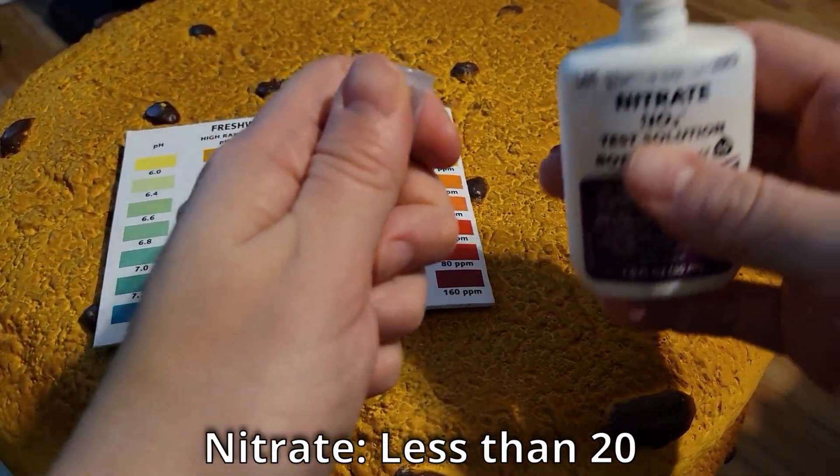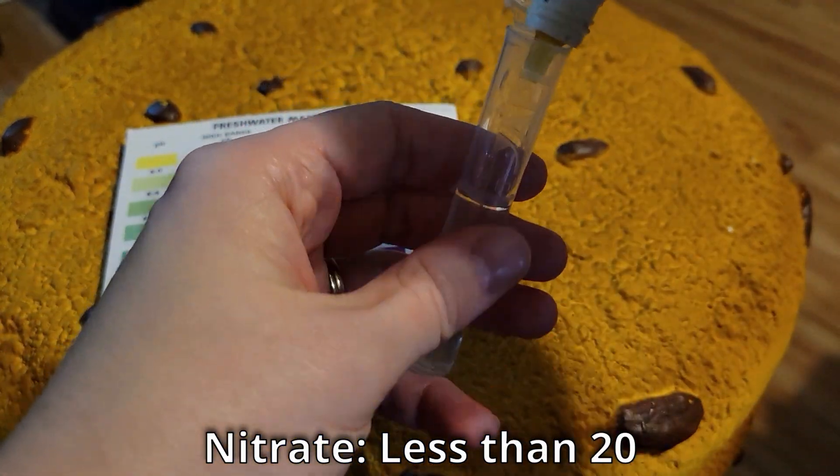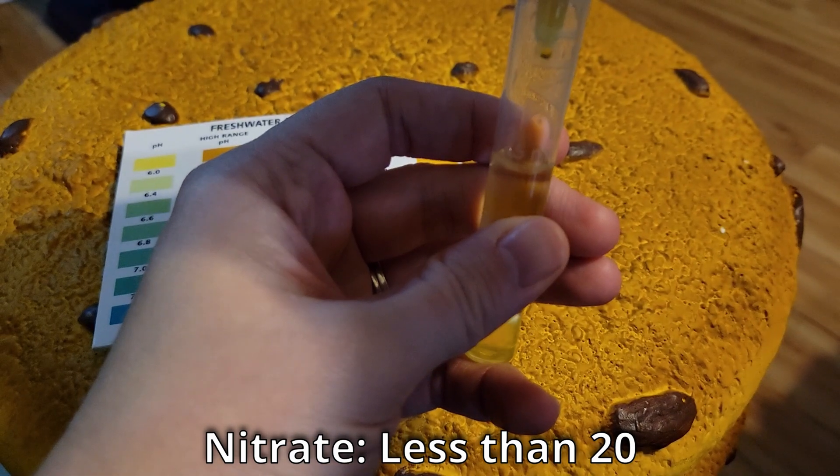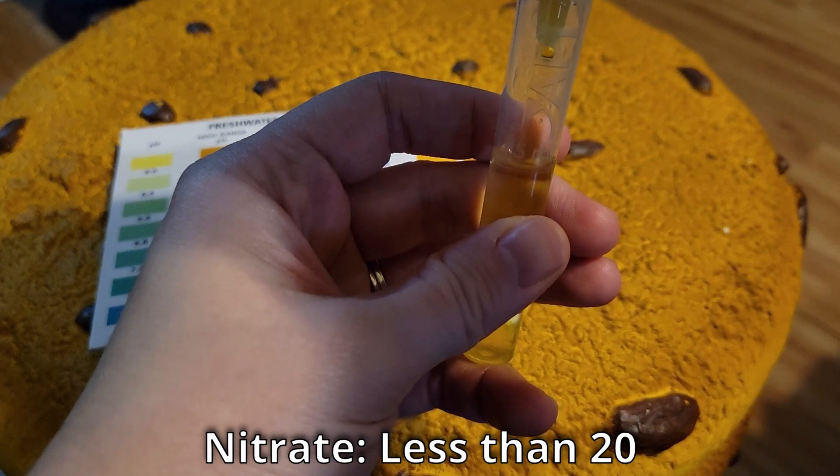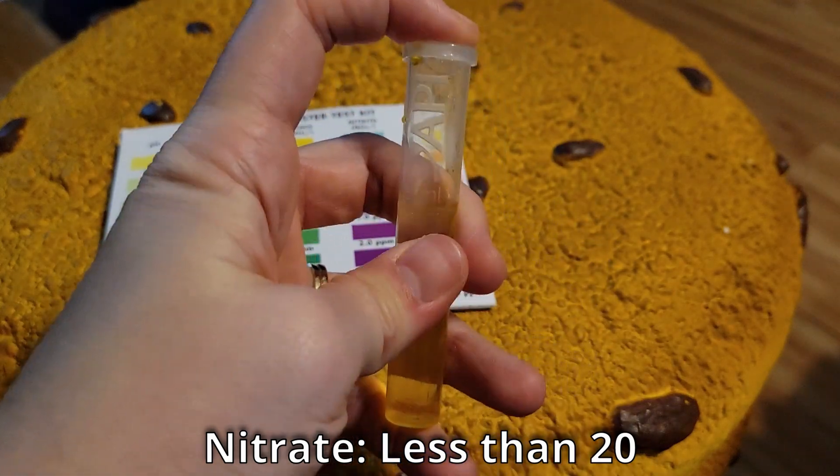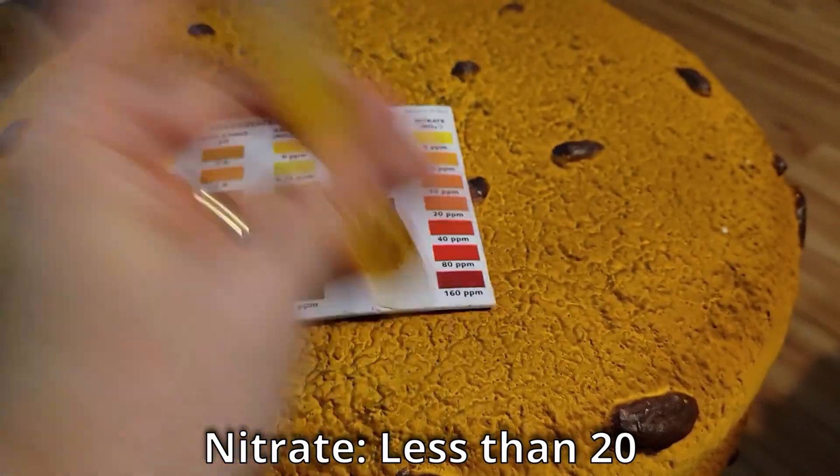And finally, we have the nitrate test. This is the test that a lot of people can tend to mess up quite easily because the instructions need to be followed precisely. You are going to begin with bottle one and add 10 drops and shake it up.